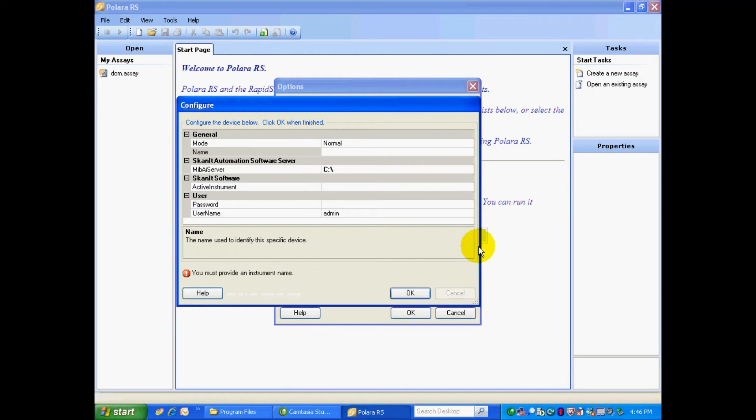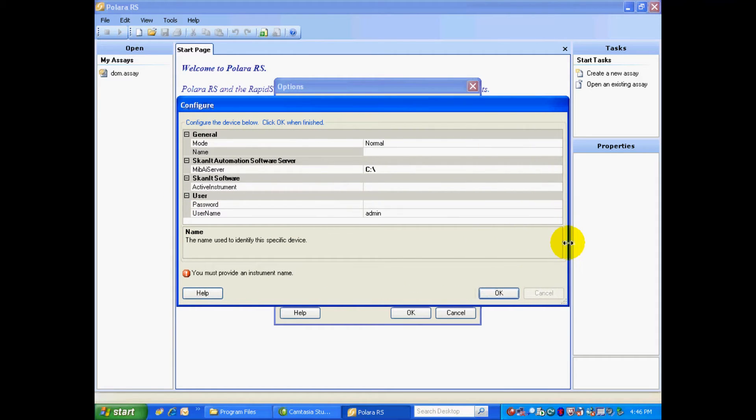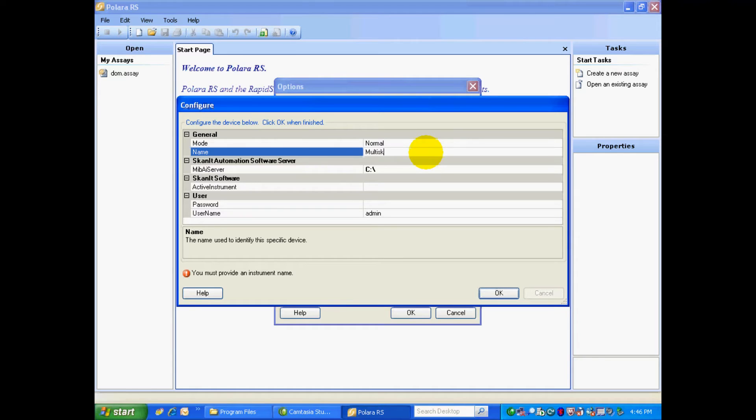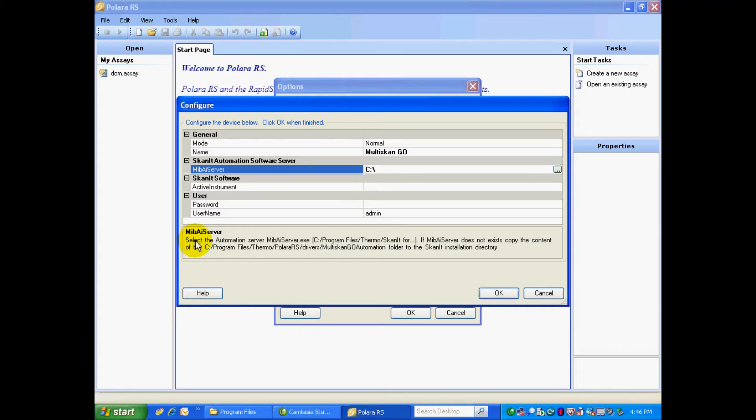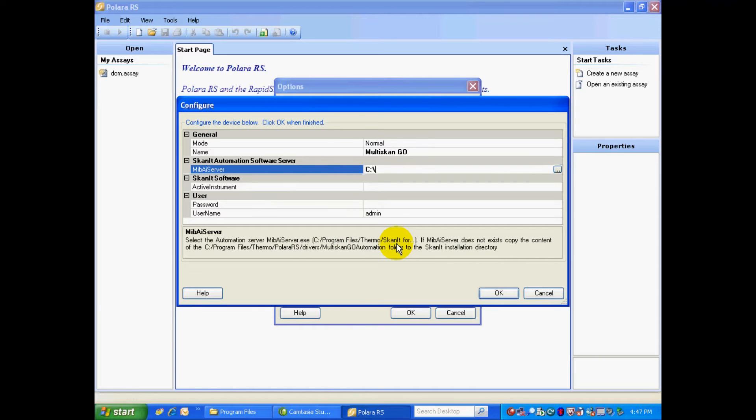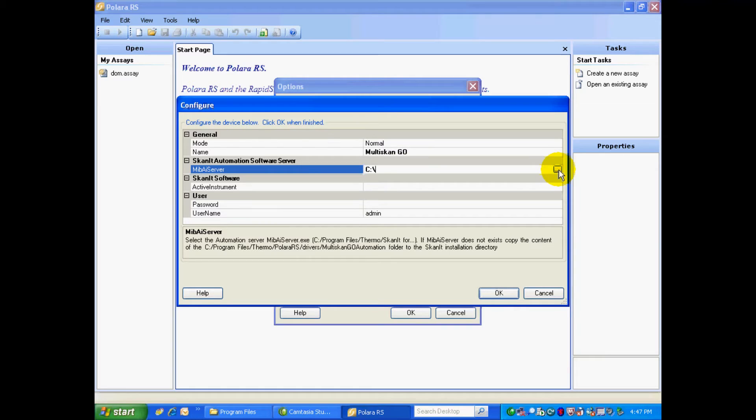So next we're going to need to fill out a couple items in this tab. So again, our mode is Normal. Our name, I'm going to call it Multiscan Go. And next we need to connect to the Automation Software. And as you see, when I clicked on this box, you have some notations coming up telling you that you need to look for the file MIBAIServer.exe in the ScanIt software. So all you need to do is follow this little path here, click on the little box with the three dots, and it should take you to the ScanIt and you click on that software. And we're going to do that right now.